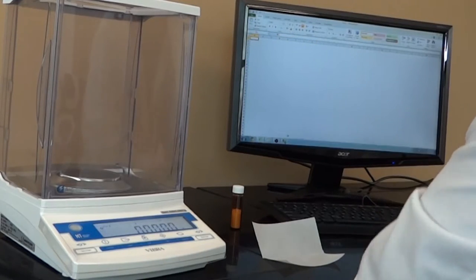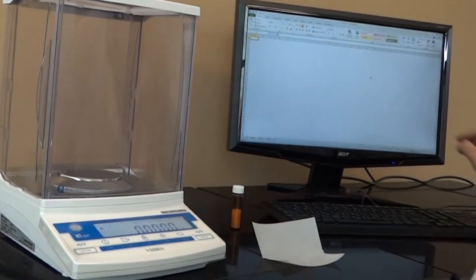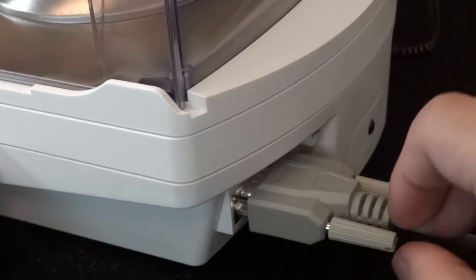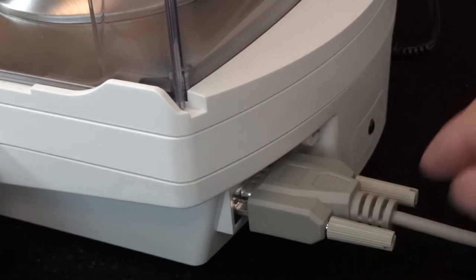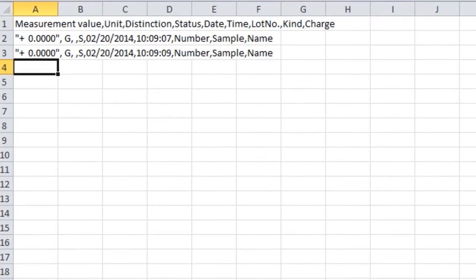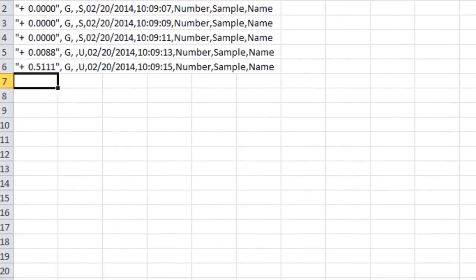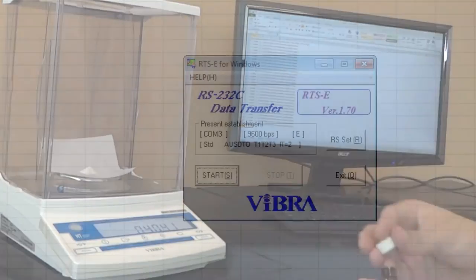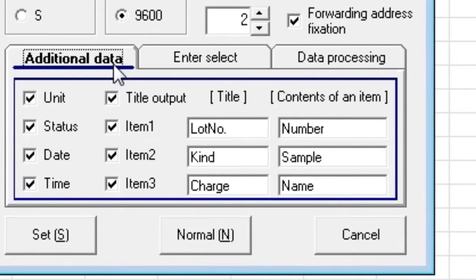All Vibra units come with downloadable wedge software. When the balance is connected to the computer via serial RS-232 or USB, the data will be transferred to the text entry software of your choice. It functions as if the weighing data is typed directly through your keyboard. The output can be customized with many labels.